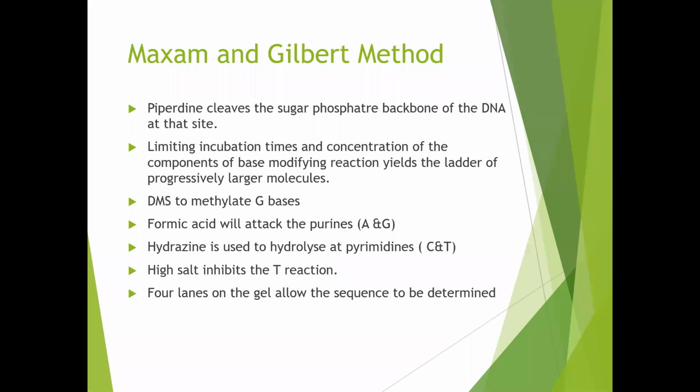So what are the chemicals that are used for base modification before you go for specific cleavage? Here we use dimethyl sulfate to methylate the guanine bases.